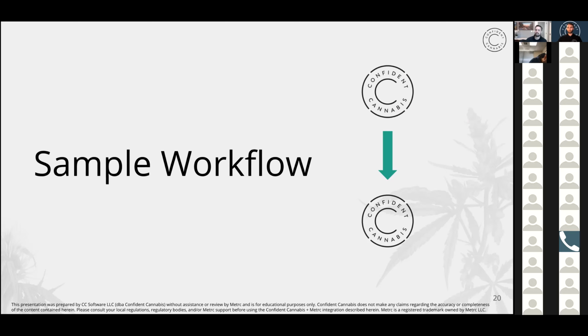So now going into the middle step. This is internally in the lab as you're processing your samples. Metrc isn't really something that you would be using directly, but the information from Metrc is helpful. So we'll show you how to do that.